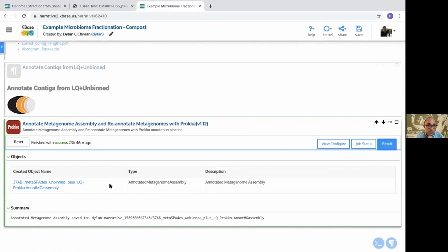And I will stop sharing and maybe, I don't know, Ben or Sean, is there anything else you want to say? Otherwise, we can maybe jump into the questions for the remaining 23 minutes. Yeah, that's what I was just going to say. What do you guys want to do? If you wanted to maybe look over some unanswered questions and or offer some more depth on some of the interesting ones. Sean, I don't know if you had other ideas, but no other ideas. Questions sound great.